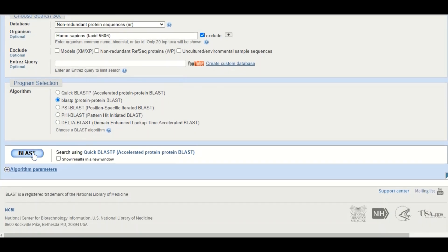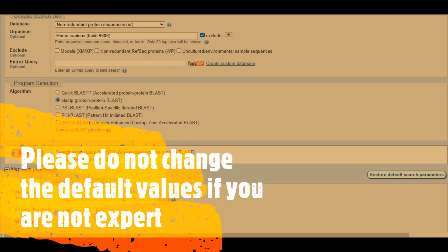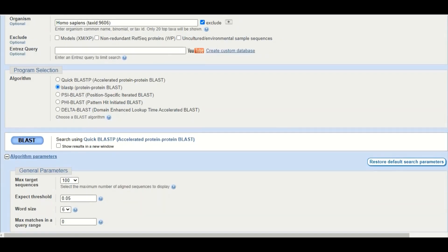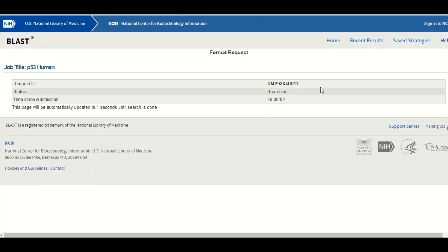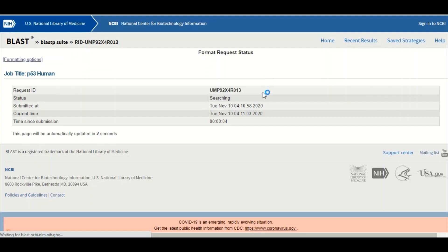After selecting all options, click the BLAST button to start your search. At the bottom you can see the algorithm parameters option — if you click the plus tab you can see the different algorithm parameters. We highly recommend not changing these parameters and going with the defaults, as changing them will affect your search results. Simply click the BLAST button and you will move to the next page showing how much time the search will take; this page will refresh after a few seconds.